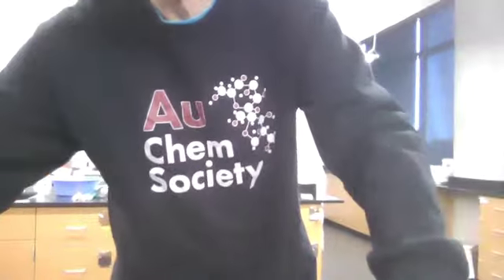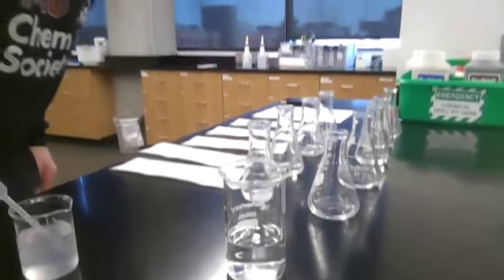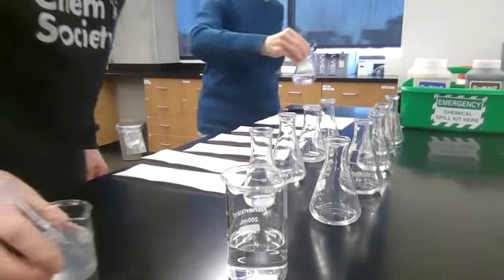Yes, the starch. So the starch takes over when the thiosulfate is done reacting with the iodine. And once that happens, the starch and iodine turn brownish purple. Here's our trial set up over here. They're all lined up. Now you can see them. Here's the starch.